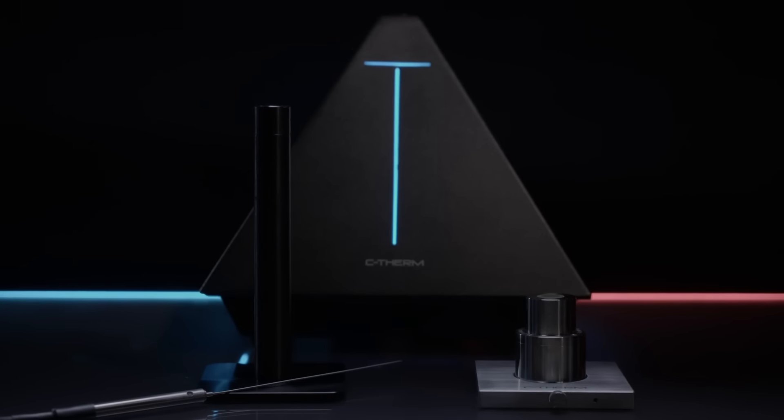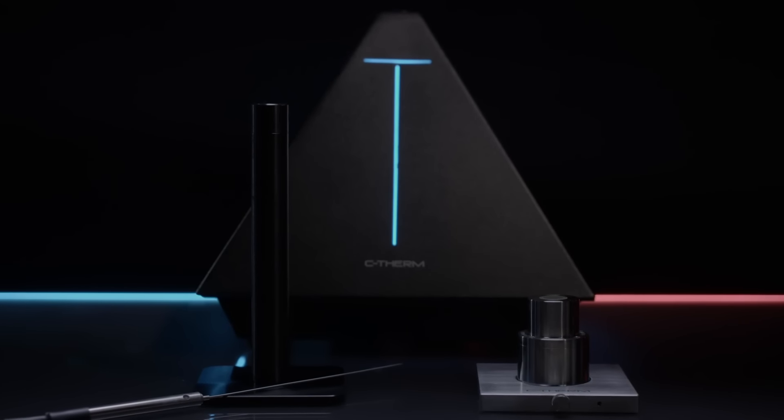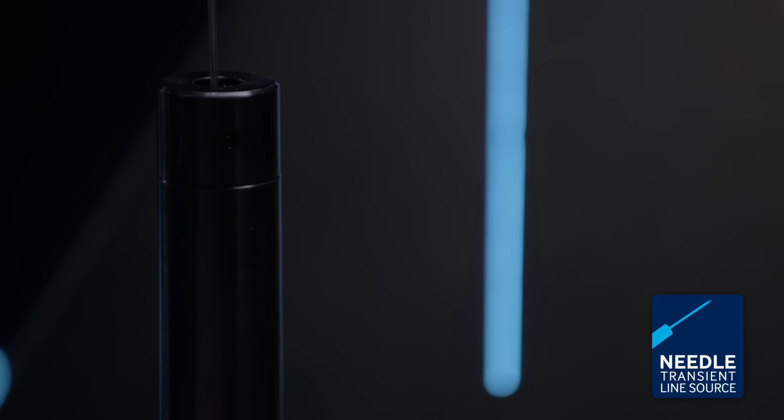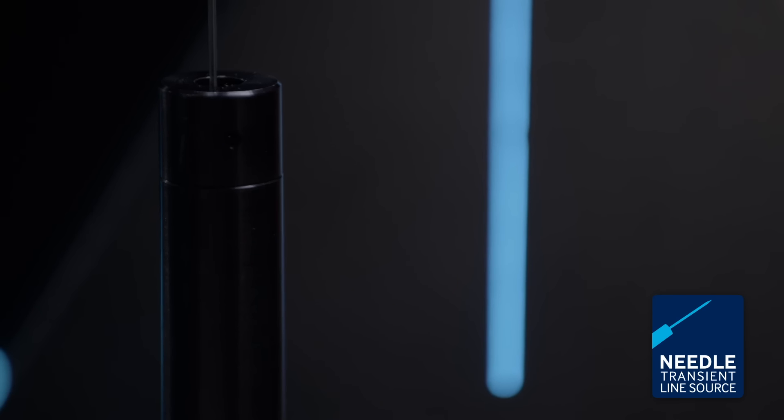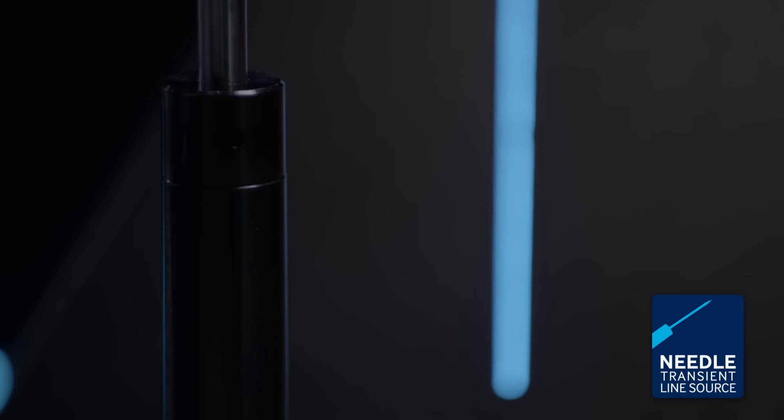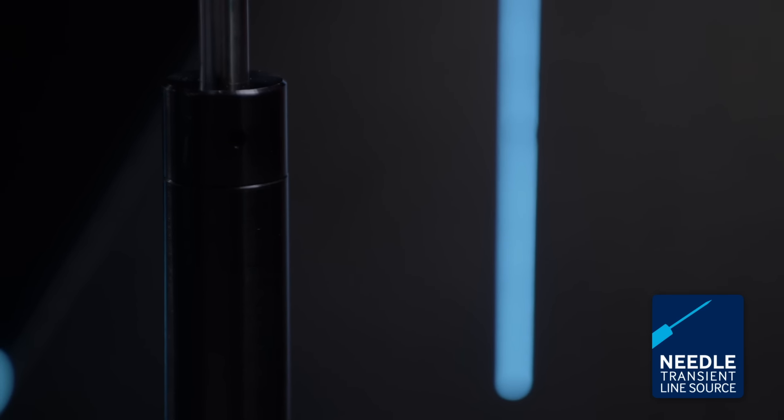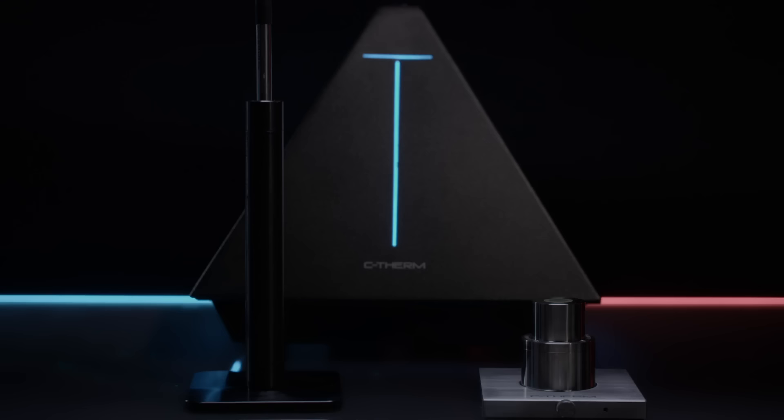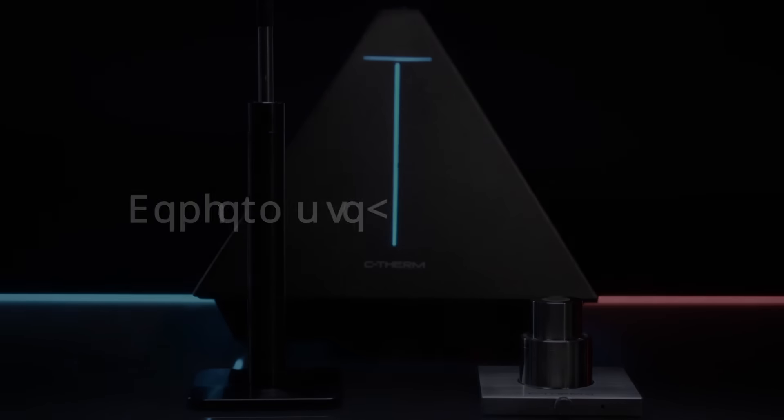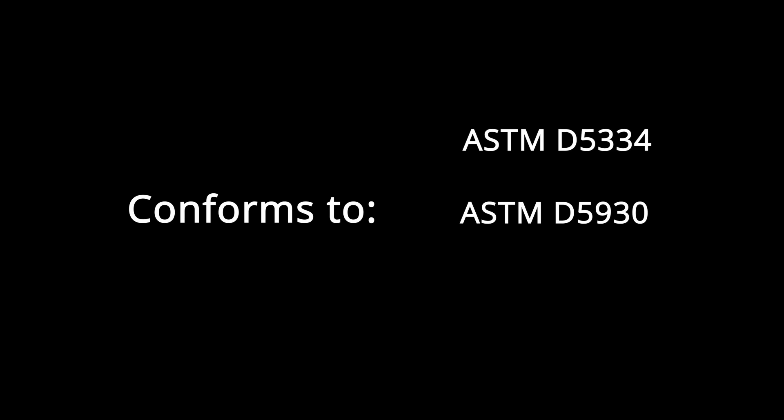Sheathed in stainless steel, the TLS, Transient Line Source Needle method, offers maximum robustness in thermal conductivity testing. TLS is best suited for granular materials, polymer melts, soils, slurries and gels.